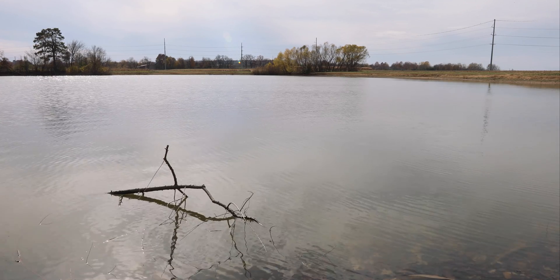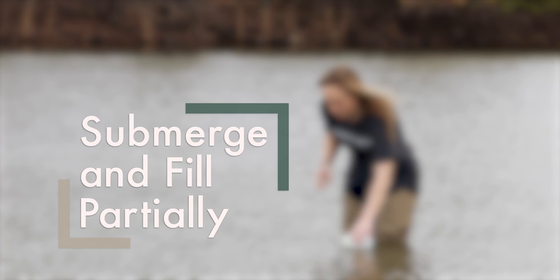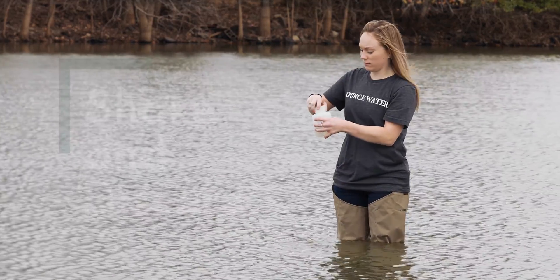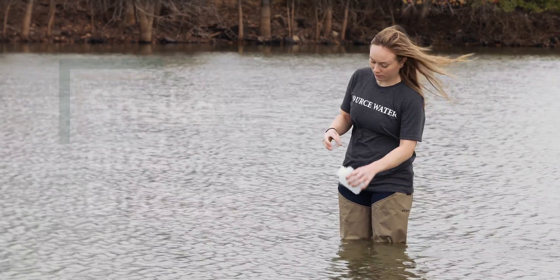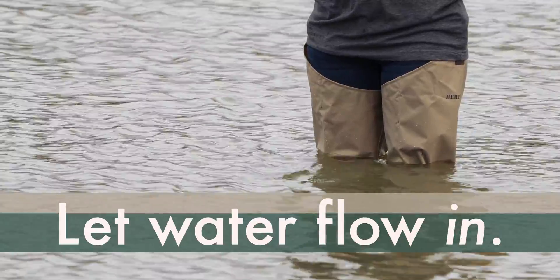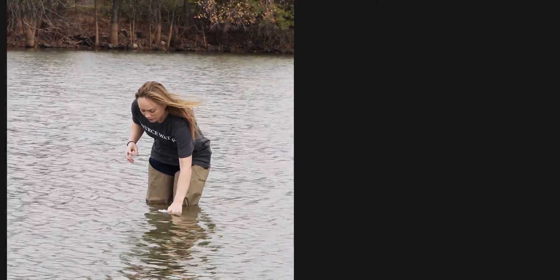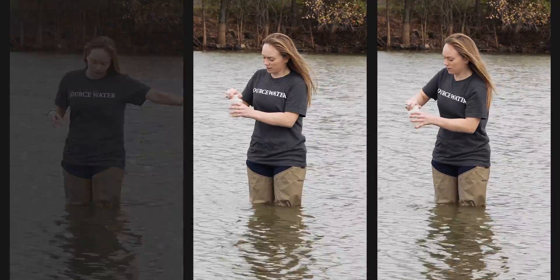Before collecting your water sample, it is important to perform a triple field rinse. Carefully remove the sample bottle cap without touching the inside of the cap or bottle. Submerge the bottle just below the pond surface and fill to about one quarter of the total volume. Replace the cap, shake the bottle for a few seconds, remove the cap, and pour the water out away from your sampling location. Remember to avoid kicking up sediment by moving your feet. If it's a windy day, face the wind while collecting your sample so that the water flows into your bottle. Repeat this rinsing process twice more for a total of three times, completing the triple rinse. The triple field rinse cleans your sample bottle with the water you will be collecting so that only your pond water will be collected and tested.